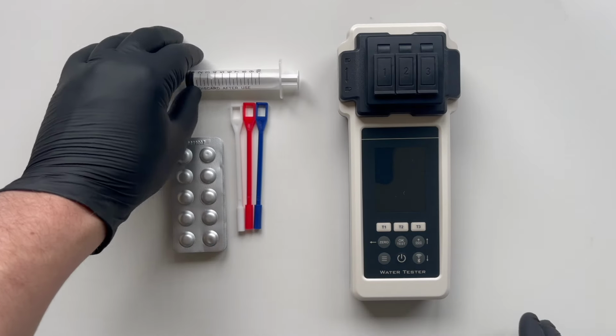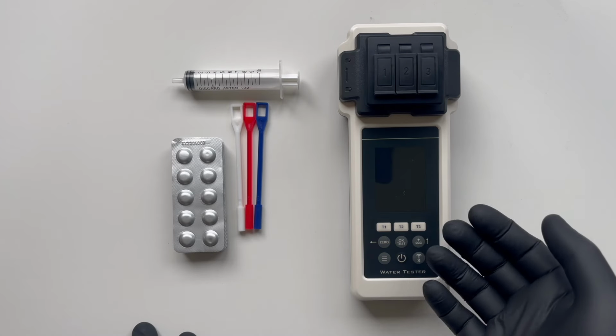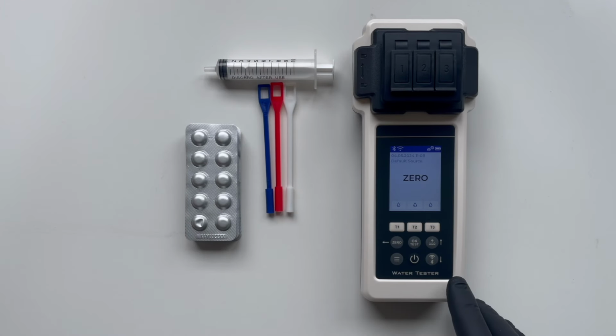We've installed the batteries. Now, let's turn on the device. To do this, press the on-off button. All right, we have switched on the PoolWaterLAB tester. Now, let's return to the manual.